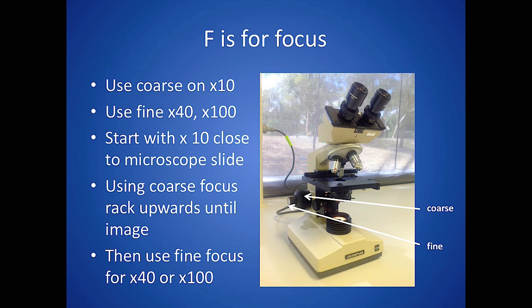F is for focus. It's important that you use the two knobs correctly. When you start off with the 10x objective, only use the coarse knob to roughly find your image. Rack the 10x objective down as far as it'll go — it won't smash the slide — then use the coarse focus to raise the objective until you see the image. You can use the fine focus a little to sharpen that image, and when you swing in the 40x or 100x, it'll almost be in focus already.